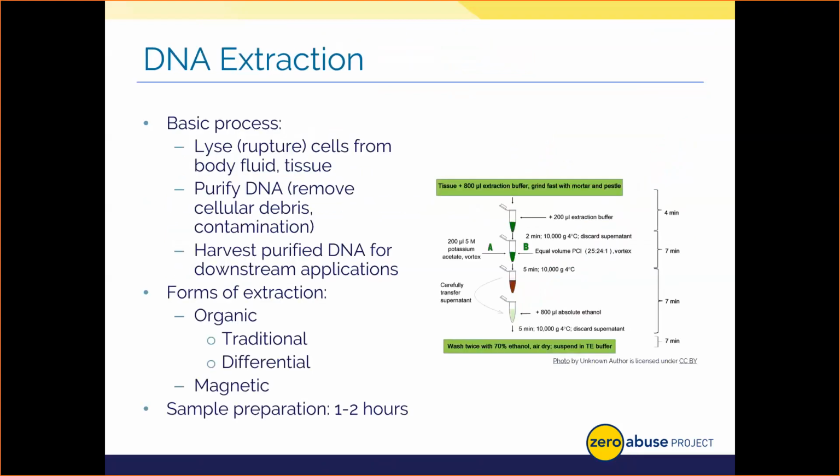So let's go ahead and give you a crash course in DNA then. At this point, if we're following through the course of a laboratory, we have a body fluid sample that's been identified, and we need to get DNA out of the cells from that body fluid for a profile. Now, if you access my first presentation in this 3-part series, I do cover DNA analysis from a much more detailed overview. But for today, we're just covering this from a very broad approach in a very fundamental fashion. So our first step in the DNA process is called extraction. Extraction is a process where we use harsh chemicals to rupture the cells and pull DNA out of them, simply put. We also have to remove other cellular debris like ruptured cell walls and proteins from the DNA so it doesn't interfere with profile generation.